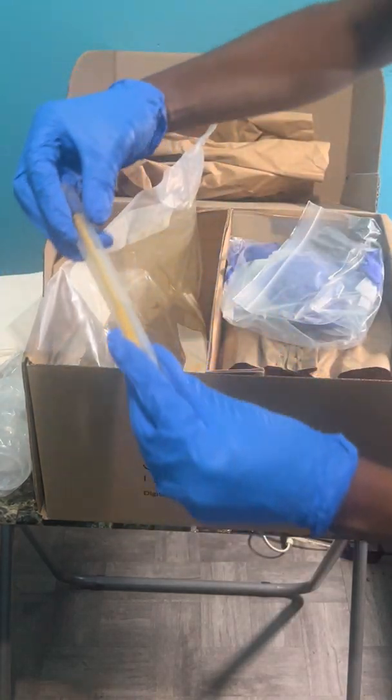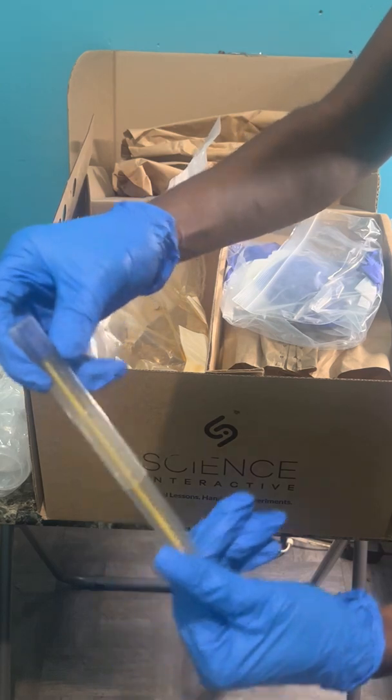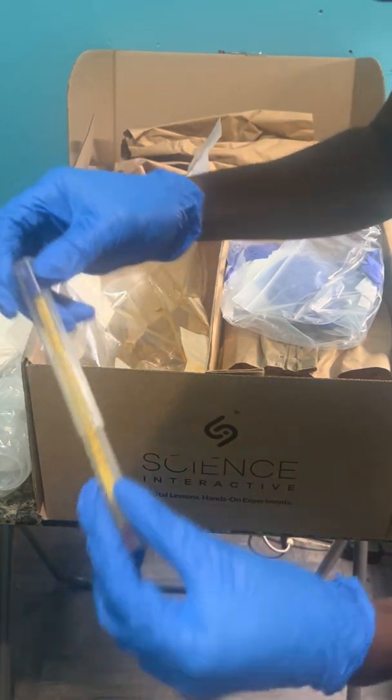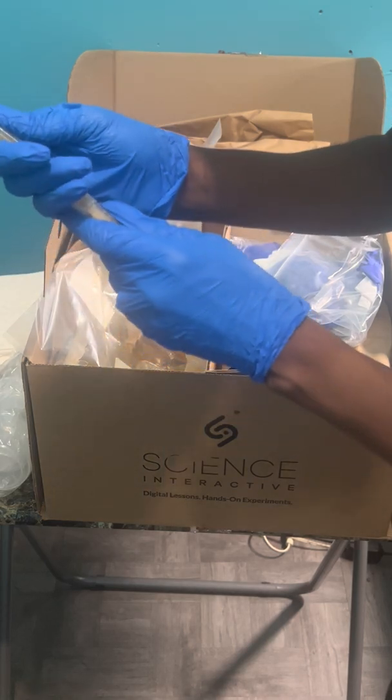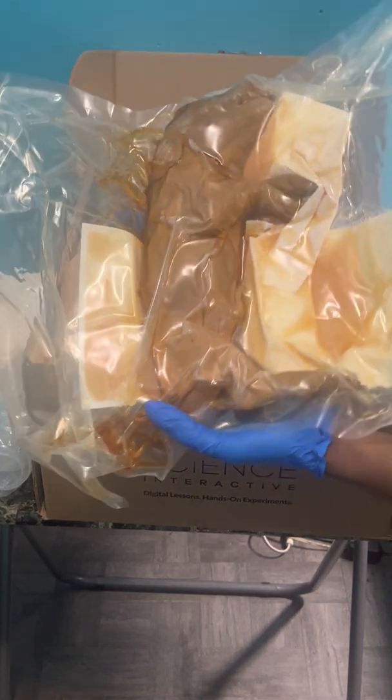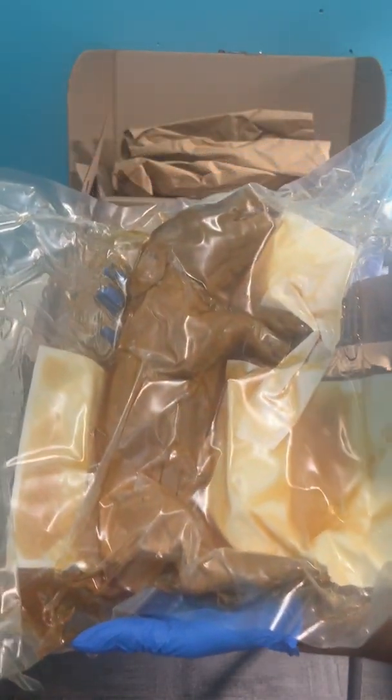I have a thermometer here — a mercury thermometer it looks like. I don't want to open it because I'm clumsy and might drop it. We have a whole pig here.